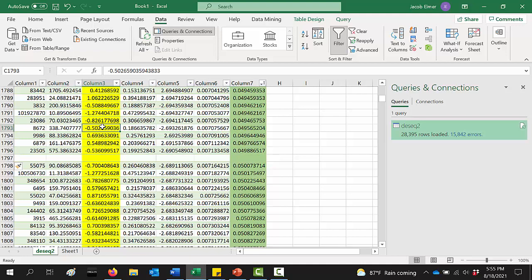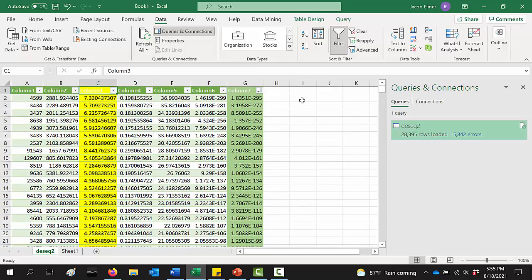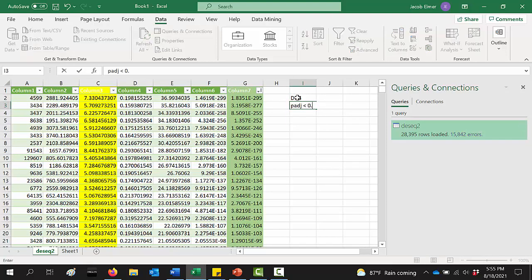And that's a rather long list, right? So I don't want to be overwhelmed by that. So that's why when we define a DEG, it's not only as a gene that has a p-adjusted less than some threshold value like 0.05, but we also look for a log 2 fold change value that is greater than 1, or another way to say that for a downregulated gene would be less than -1, because that means it has been changed 2 to the 1, which would be at least 2-fold between the different samples.